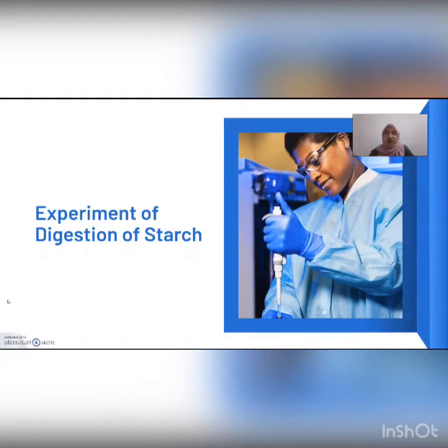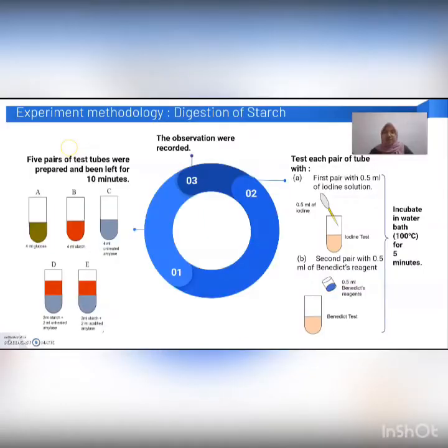So right now, I'm gonna show you guys our first experiment, which is experiment of digestion of starch. First and foremost, we're gonna start with experiment methodology. For this experiment, we have 3 steps, all of them.